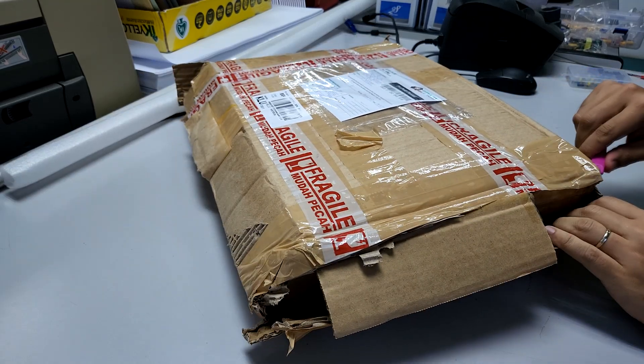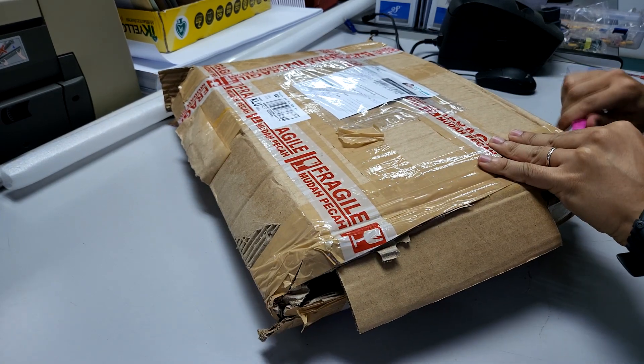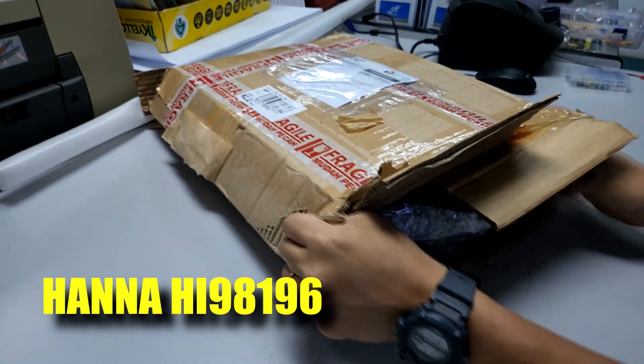Hi guys, thanks again for visiting us at RS Aquaculture. For today's video I'll be going through an unboxing video of our latest HANNA probe, which is the HANNA HI98196.